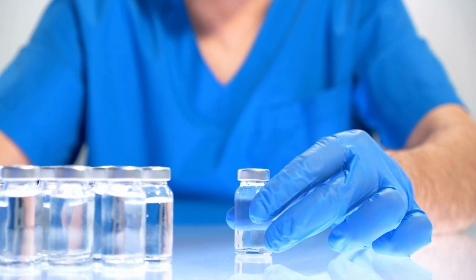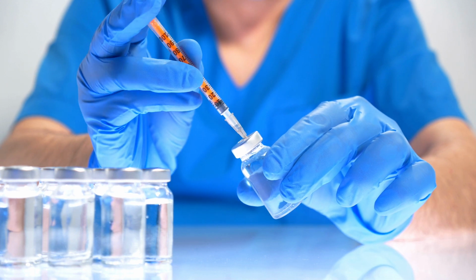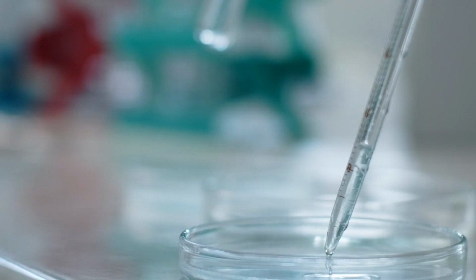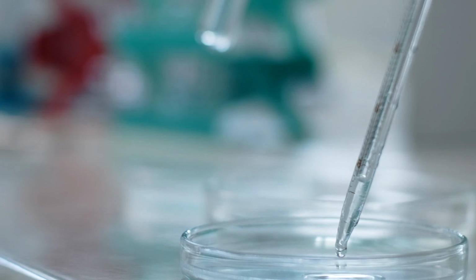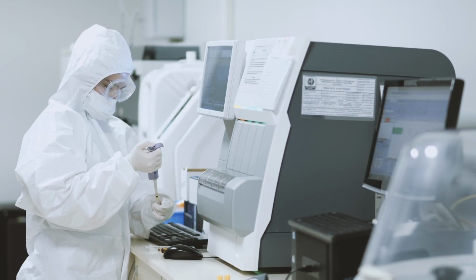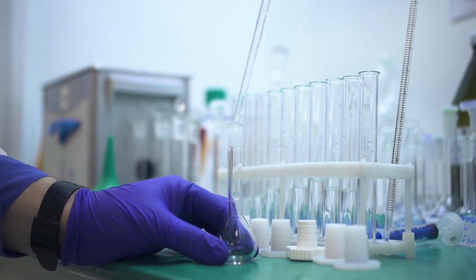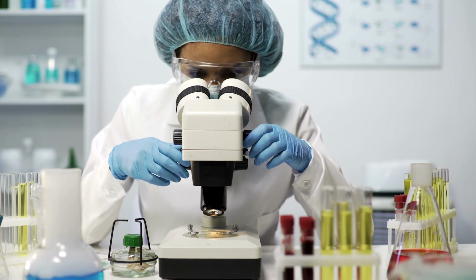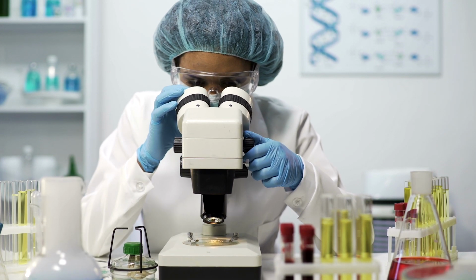Of course, for pharmaceutical products, like vaccines that are used to medically treat viruses and infections, sterility testing is paramount. In the pharmaceutical industry, clean rooms are a highly suggested complement to testing because of their sterile environment. For vaccines, the validation test is needed to determine if the sample will inhibit the growth of microorganisms.